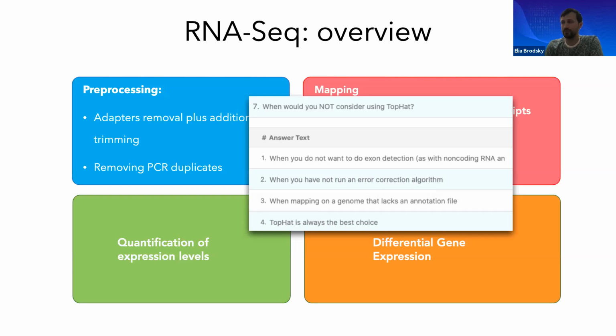So why would I say that differential gene expression is kind of your standard end to this logic of RNA-seq expression? Because typically, or historically, I probably should say, experiments were designed around simple comparisons. I have one set of samples that represents condition. I have another set of samples that represents control. And so when I want to understand a condition, I just compare it to the control. However, as people started generating more and more data, it started to be clear that you have a lot more variation. For example, if you have a condition like cancer, you can say, here's a healthy person and here's a person with cancer. But the healthy person is probably, maybe they're healthy from cancer, but they have diabetes. Maybe they're healthy from cancer or they have heart disease, right?